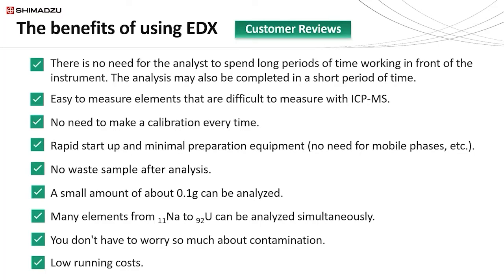There's no waste after analysis. This is very key, actually. For example, techniques that use mobile phase accumulate liquid waste, but XRF is a non-destructive technique, meaning that you recover the sample after analyzing it.